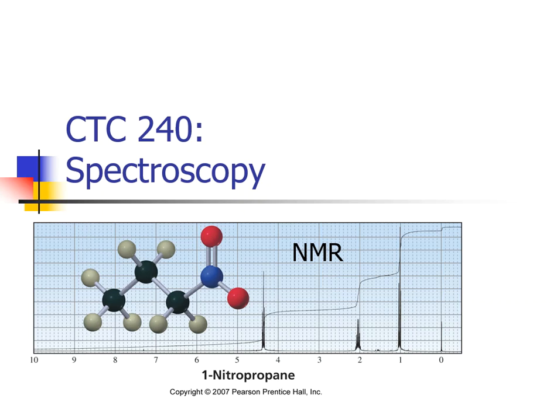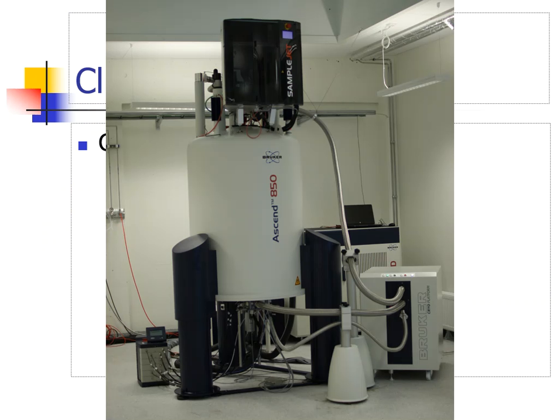So before we go on and learn more about this wonderful world of NMR that's going to make your life miserable for the next 2 weeks, or maybe the next week, I want to show you what we're actually using in a laboratory environment. This whole concept of, hey, let's put in a compound and let's get these lines on a sheet of paper. Where is that actually coming from?